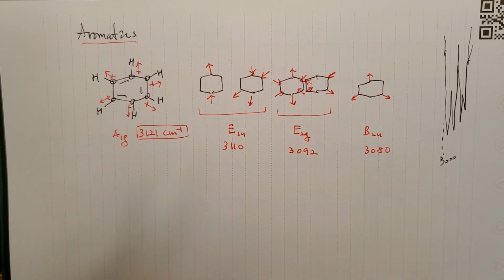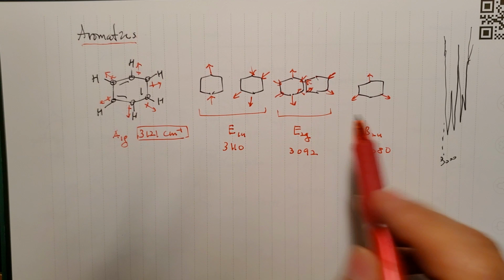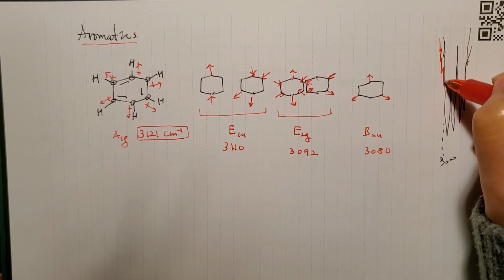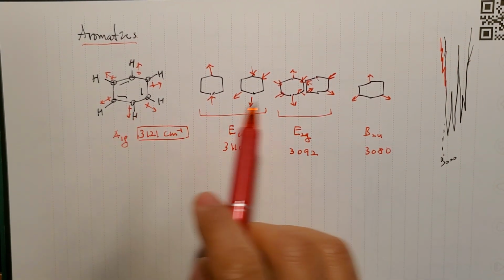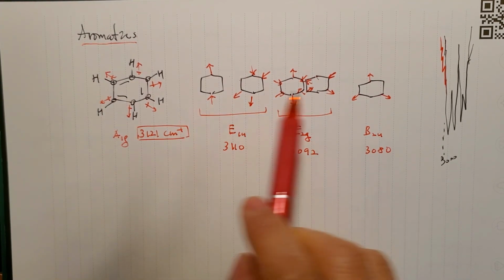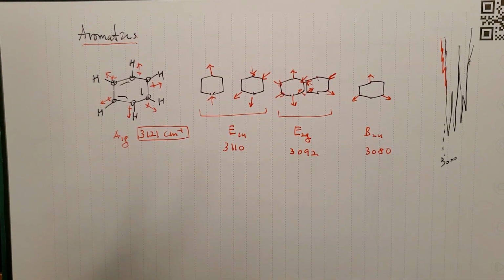Then these things come just like the sp2 CH of alkene. Many of them can show up. It can show many shoulders, okay, depending on what you have. Some of the peaks become more polar, so more intense. So the spikes can change, like a small but big here and small and big there, depending on what you have.